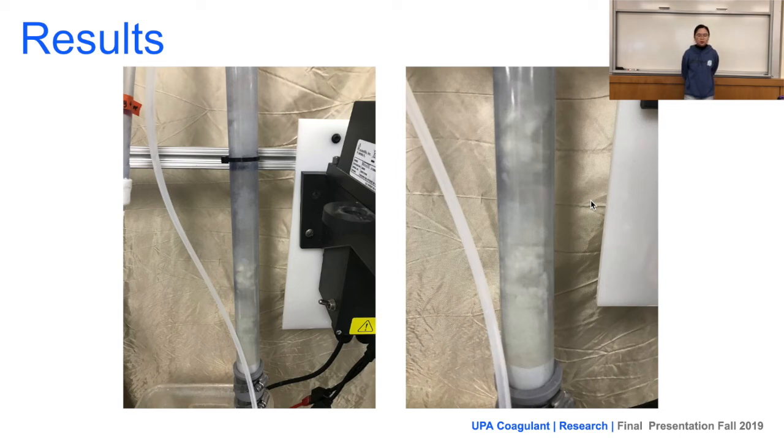While we were running our experiments, we noticed that there's a lot of gelling, which means that there are a lot of places in the tube settler where there are really dense floc blankets. We believe that the source of this problem was that the influent turbidity was around 700 NTUs for about 30 to 40 minutes in the beginning of the experiment. So the team solved this problem by modifying our experimental apparatus to allow the influent to go directly to the wasteline before it reaches the target of 100 NTU.